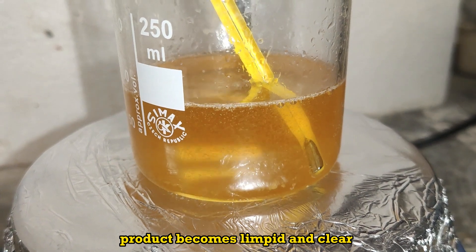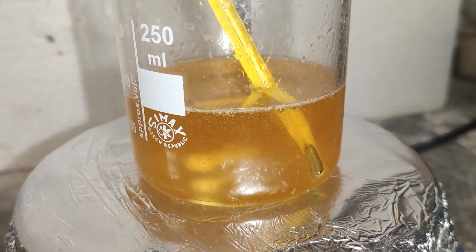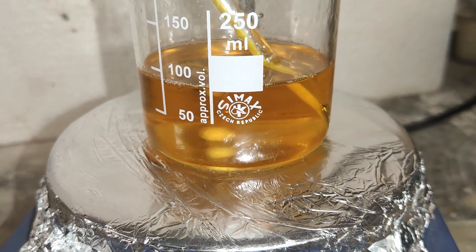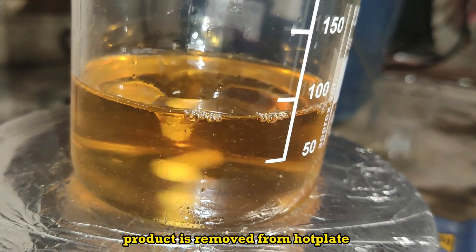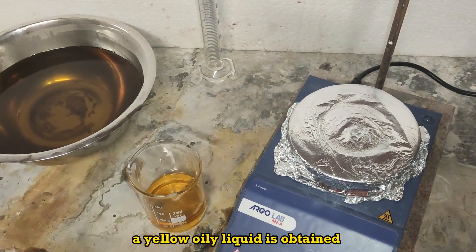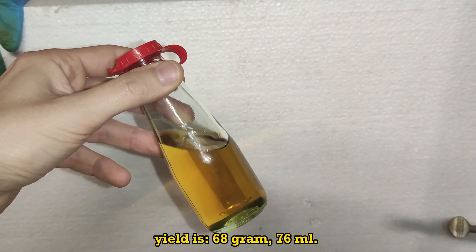The product becomes limpid and clear with warming. Once evaporation is finished, the product is removed from the hot plate and let cool to room temperature. A yellow oily liquid is obtained. Yield is 68 grams, 76 milliliters.